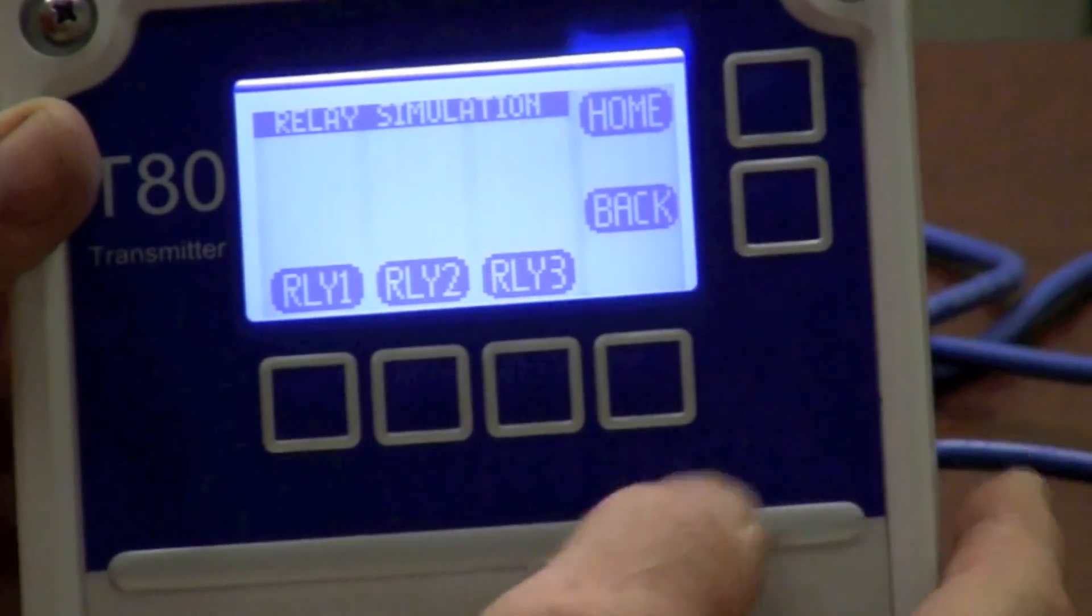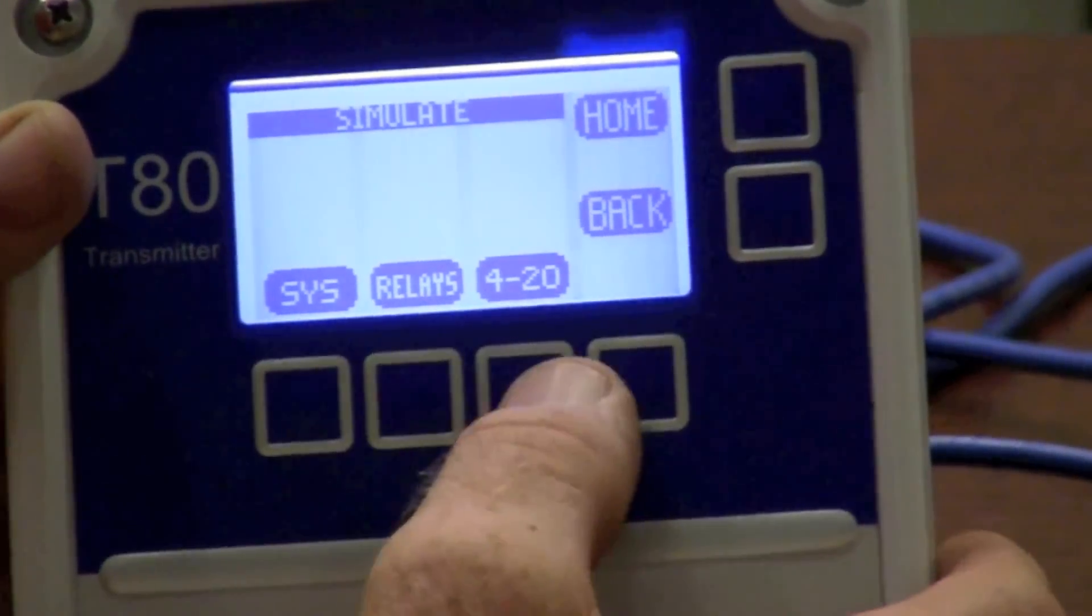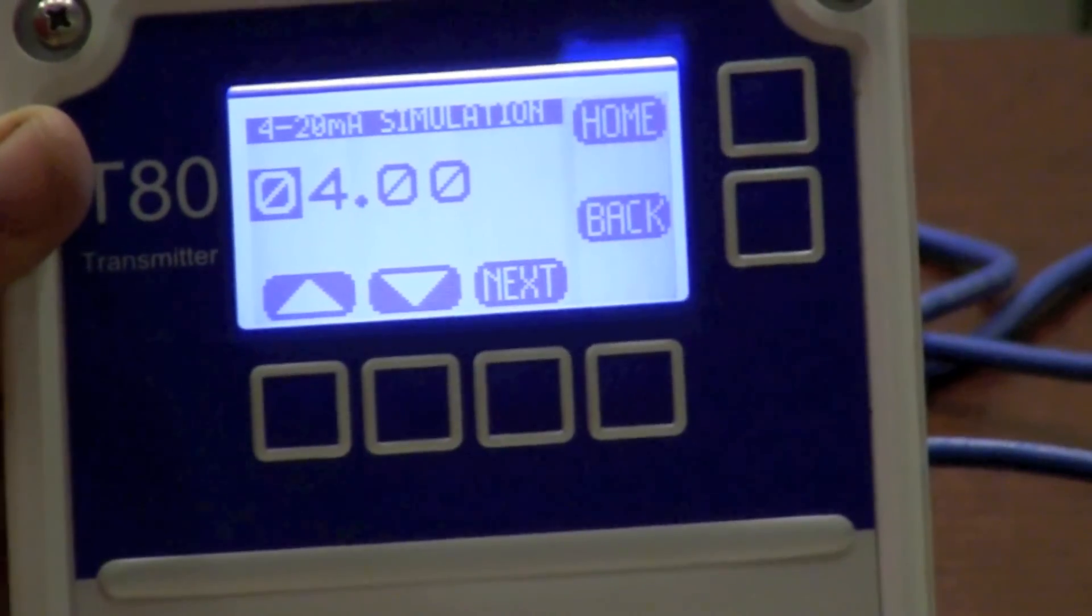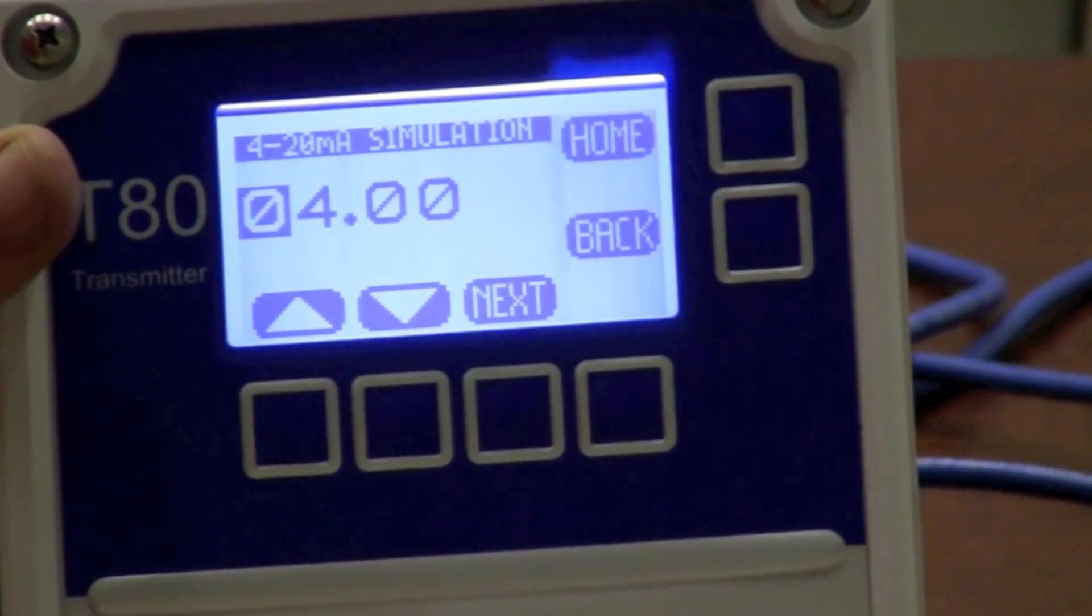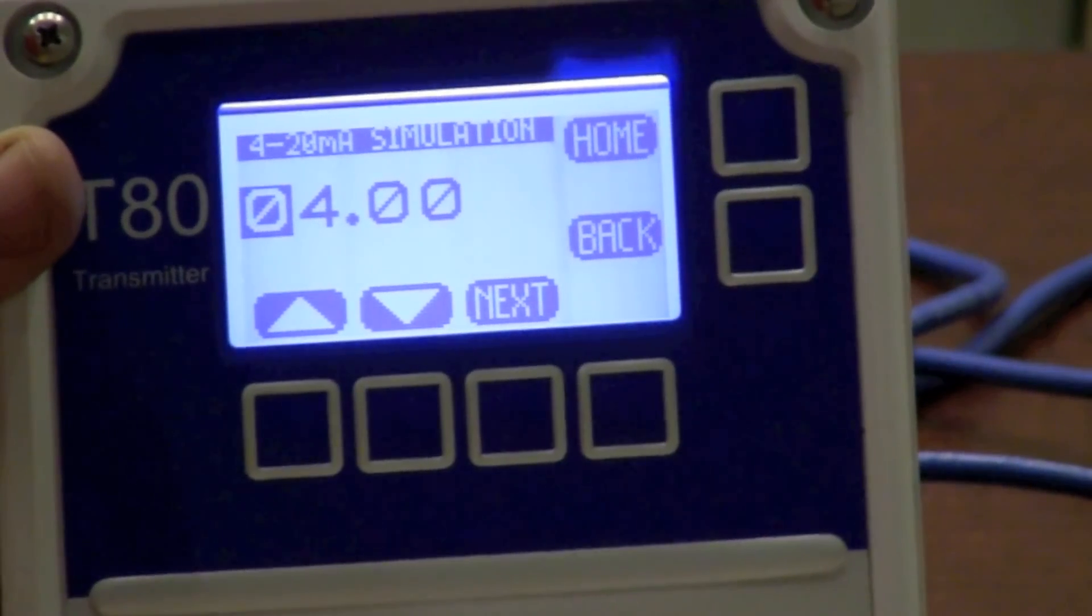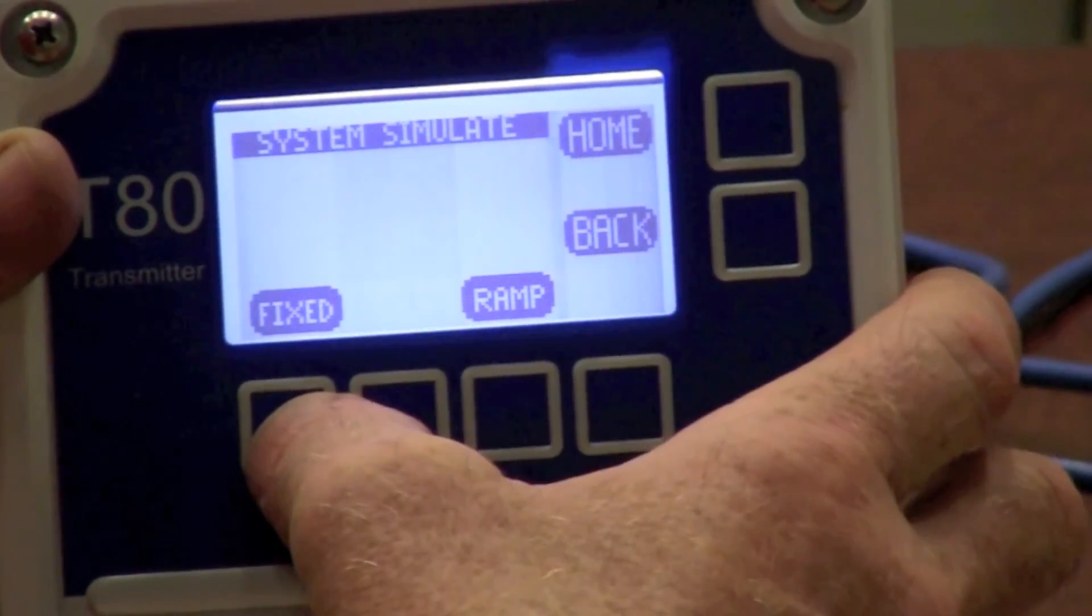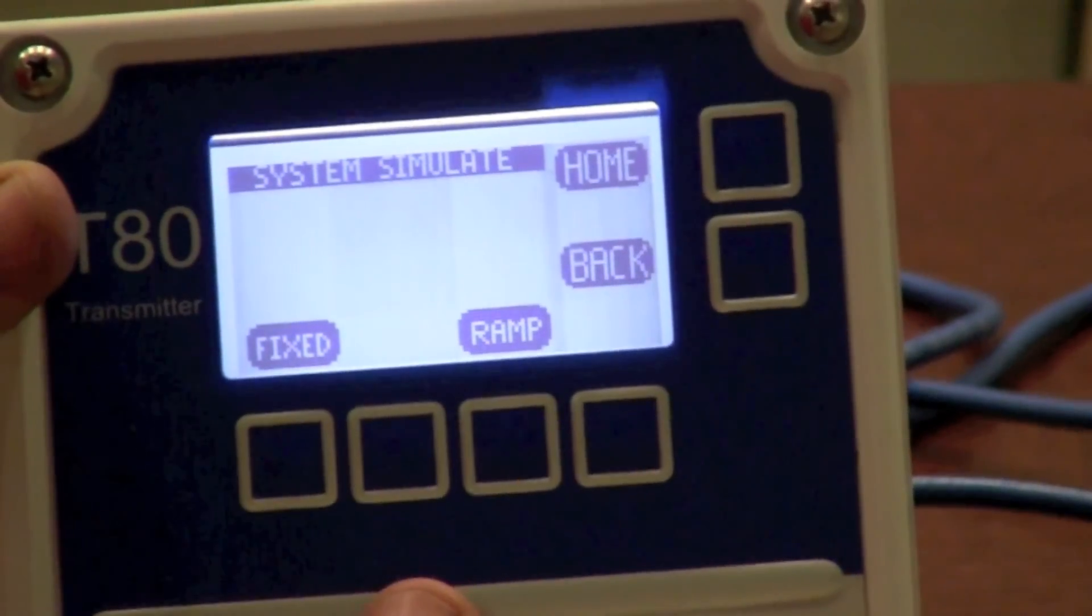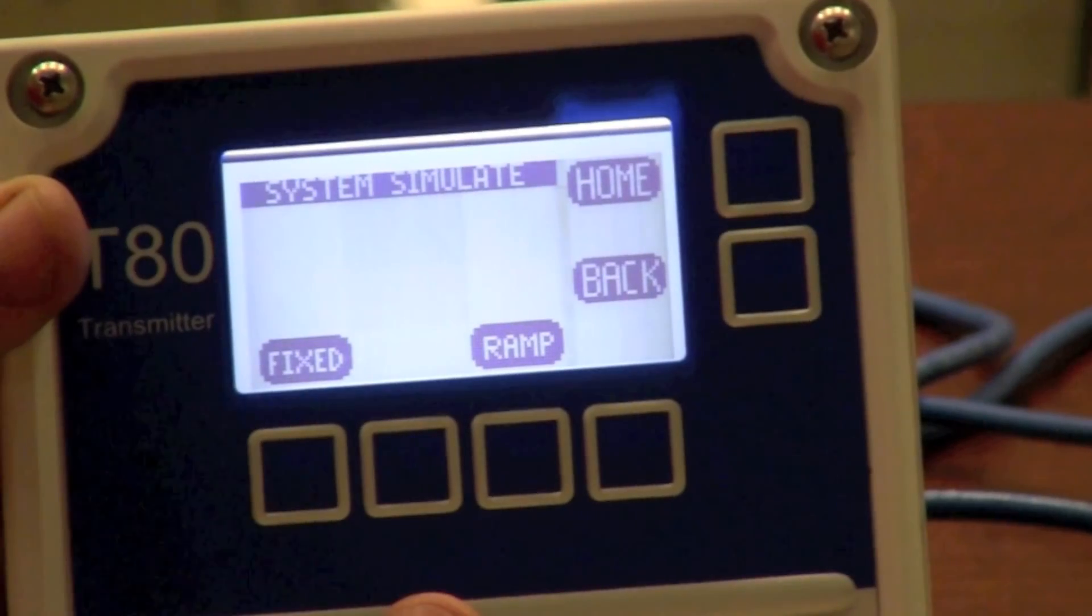Pushing the back key, I can come over and simulate my 4 to 20. Ensuring that my PLC is scaled the same as my pH transmitter in the field. A very common error. Also, I have system simulate. And this allows me to ramp my analog output if I wish.